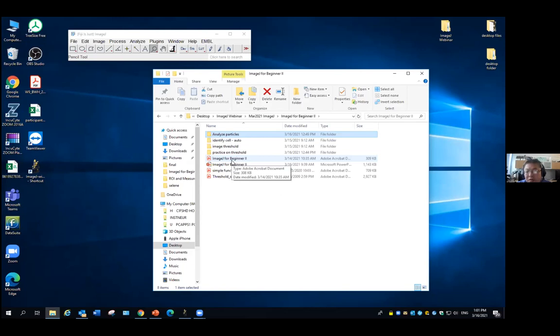As yesterday, we talked about that if you have an image, like say a cell, like a simple one, you can manually draw them one by one, and then you can put them into what we call the ROI manager, because every single cell, once you draw them, you create a region of interest, the ROI of it. And you can save out the cell outline you draw into the ROI manager, and you can do the measurement on each single one of them.